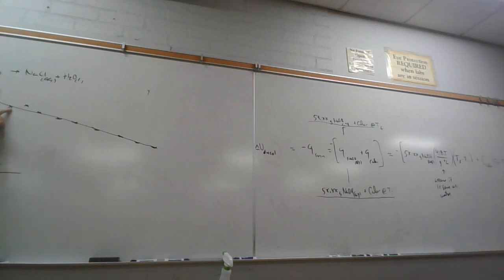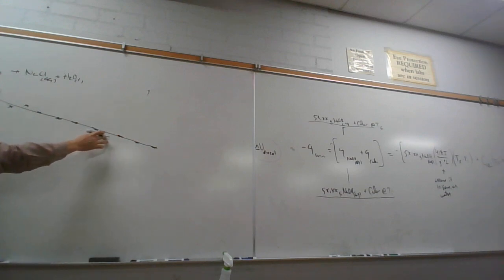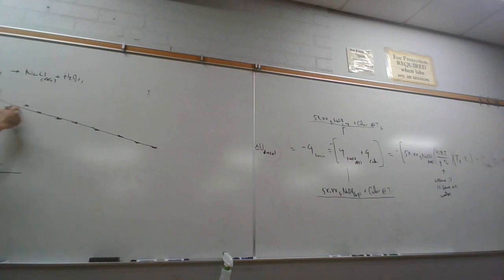So here we hit a little cold spot, but there's a little hot spot. Actually, this cooling curve doesn't meet right. Something like that, or vice versa. So we ignore these initial points because we might not have it well mixed, and we focus on the latter points here to go back to where it should have been had we mixed it in one instant of time. If we could have mixed it in one instant of time, it'd pop up here and then start cooling down gently. So we'll back extrapolate this to there.